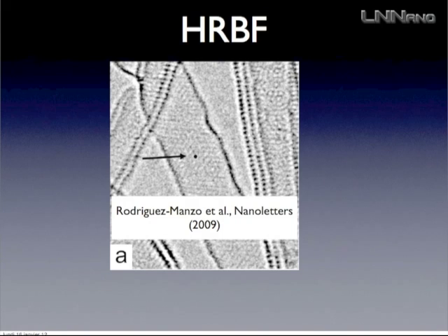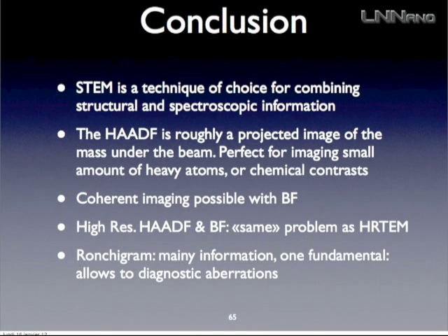Okay? So now we have reached a point where making one or the other is, in terms of contrast and resolution, almost the same. But of course, if you want to make a high resolution image, it may still be worth doing it in TEM because it's a little bit quicker. Okay, so let's conclude my lecture.